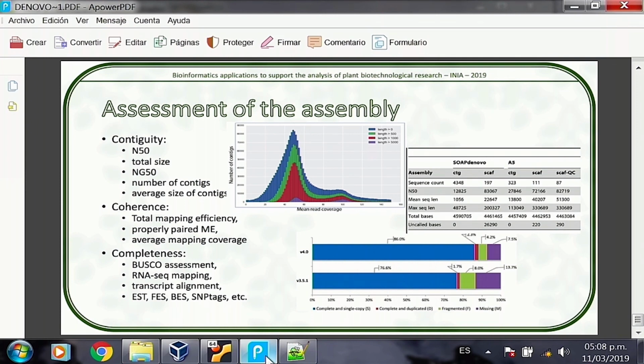If you have fewer, then it means that you're missing that spot. It doesn't necessarily mean that your genome assembly is bad, but it does mean that it doesn't contain as much genetic information as you want. And more importantly, it doesn't contain the gene coding regions that you want, because that's the main idea behind assembling a genome: to get the coding regions.